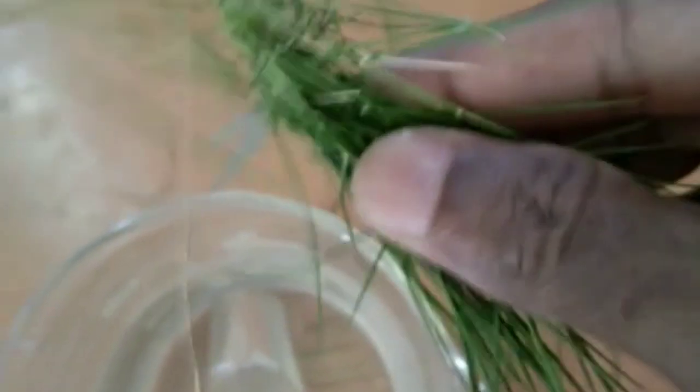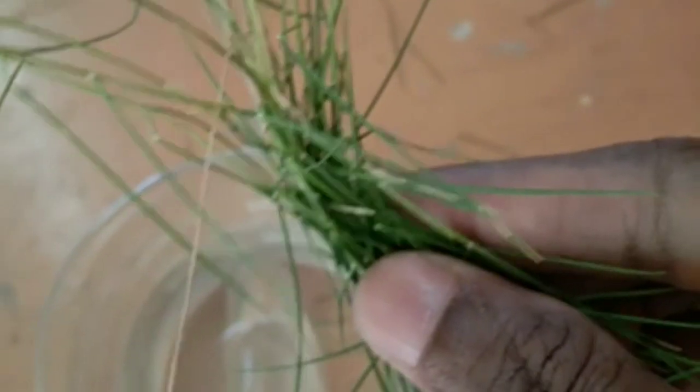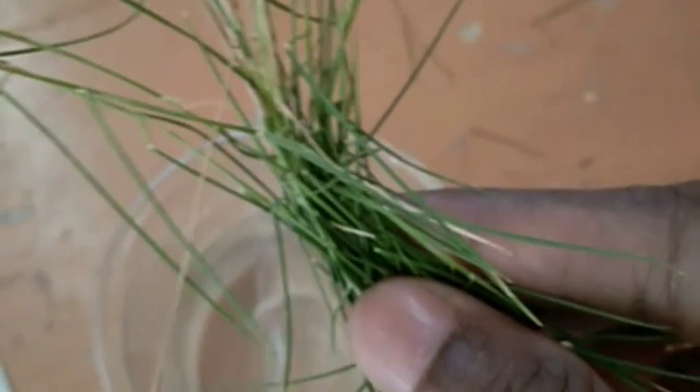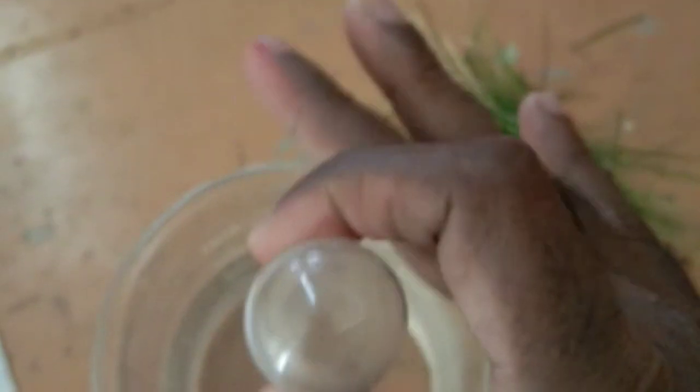Now I do the process by taking the materials. I take grass but we need a Hydrilla plant. I don't have Hydrilla plant but I take only grass. Then I take a beaker, a test tube, and one funnel also.